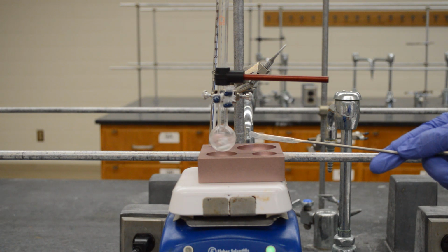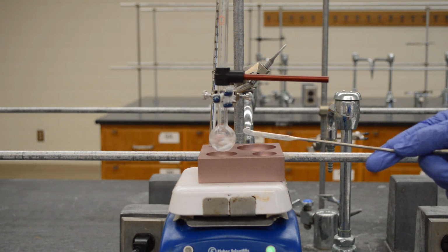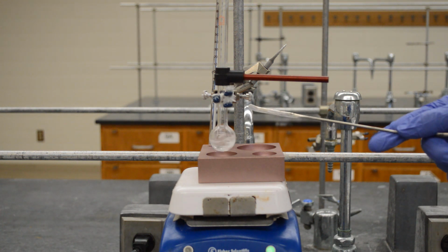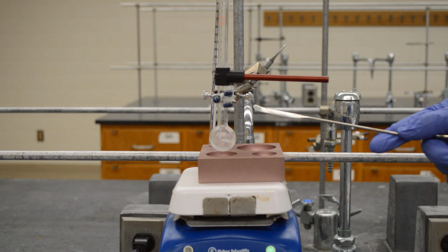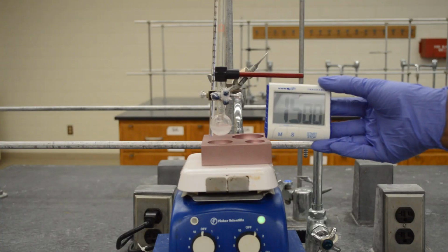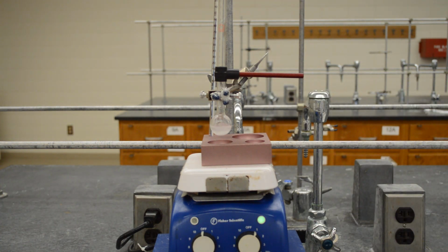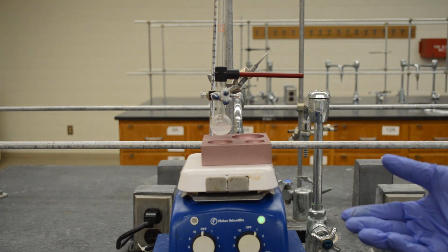At this point in your reaction mixture, what you have is sodium benzoate and methanol. Sodium benzoate is the intermediate, methanol is the byproduct. So the next step is to convert benzoate into benzoic acid by adding sulfuric acid. After about 15 minutes of stirring, now take the reaction mixture to the next step, which is addition of sulfuric acid.